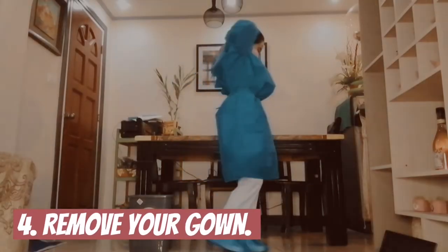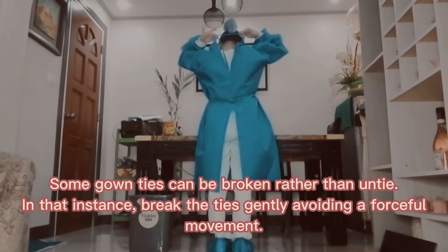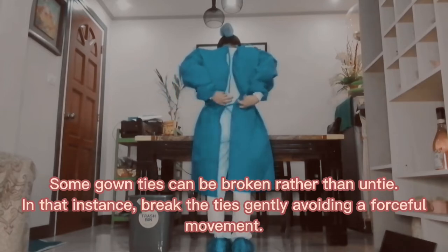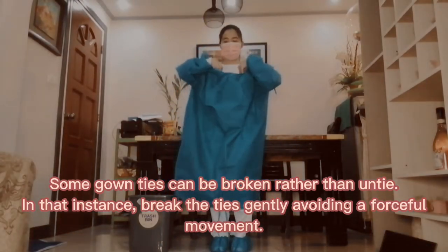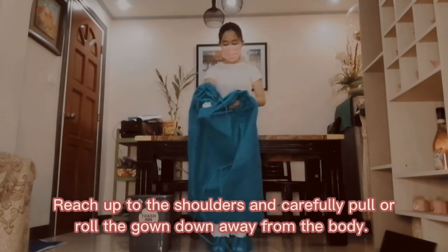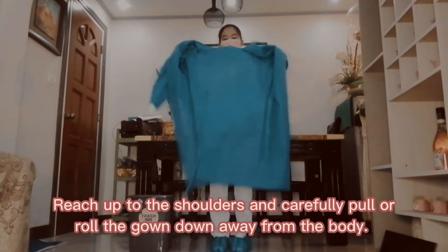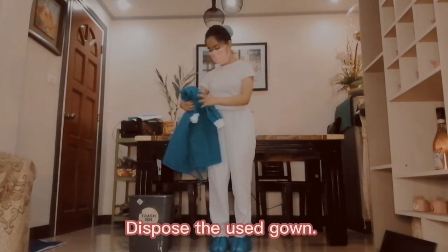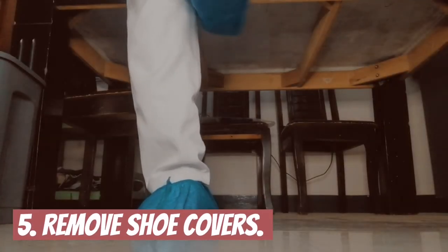Remove your gown. Untie all ties. Some gowns' ties can be broken rather than untied. In that instance, break the ties gently, avoiding a forceful movement. Reach up to the shoulders and carefully pull or roll down the gown away from the body. Dispose of the used gown. Remove shoe covers.